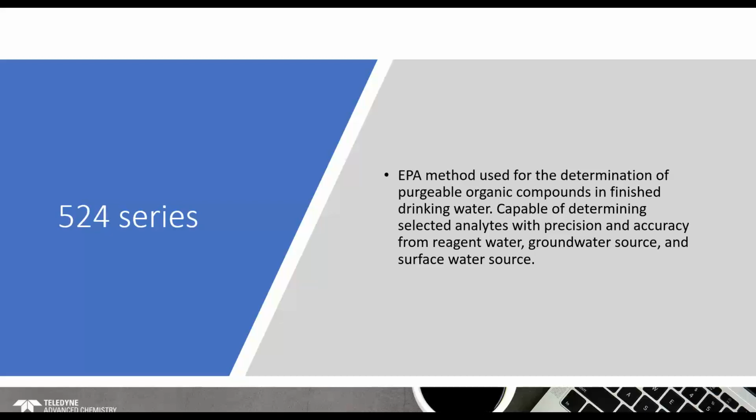I do want to point out that 524.2 specifically is for all stages of drinking water production and treatment, and that Method 524.3 does not replace 524.2. In this webinar, I will take some time to briefly discuss the method QC requirements, the equipment involved, and a difference and similarity between each revision.